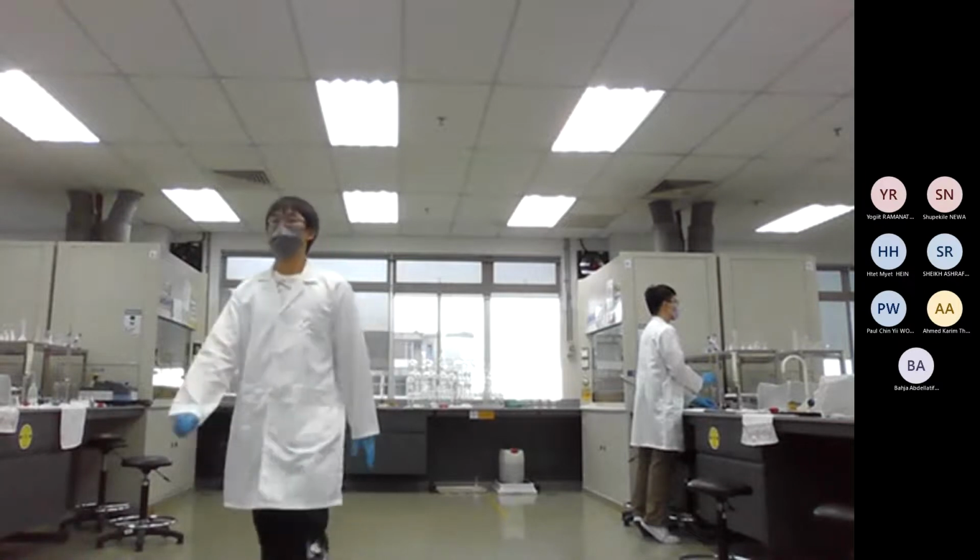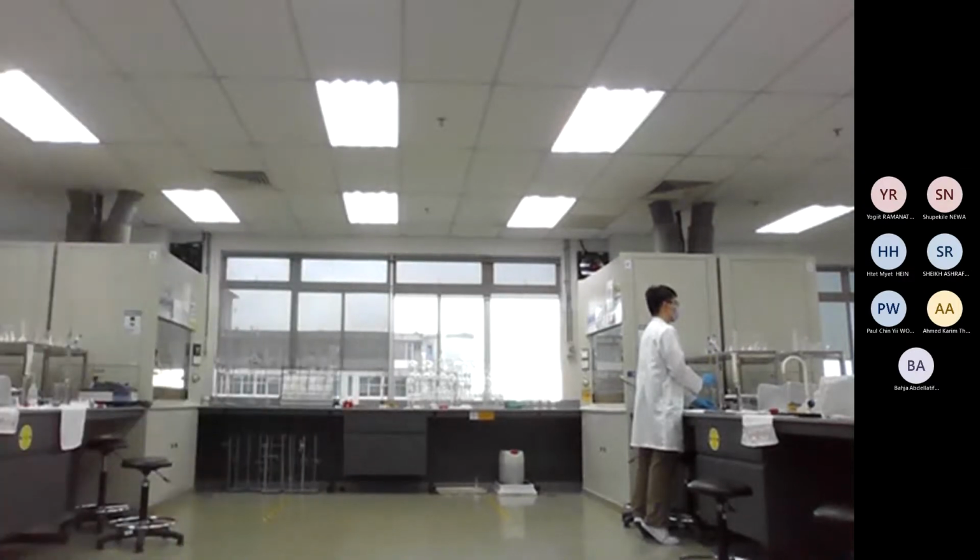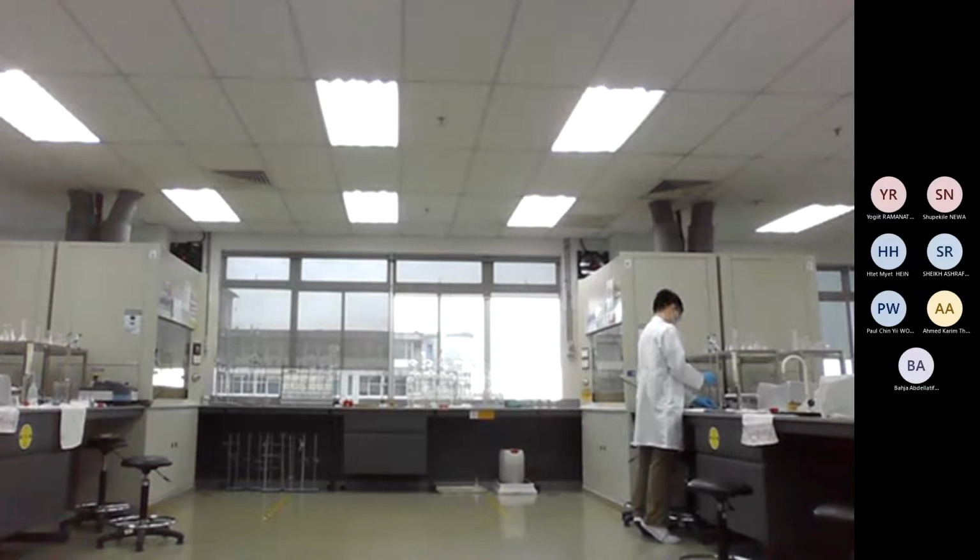Do we have to separate it into volumetric flask or into chemical flask? It's kind of confusing for step 3. Like this one, repeat step 2 by preparing the 4 solutions. Do we need it to be in a flask or volumetric flask? Are we using the same concentration?